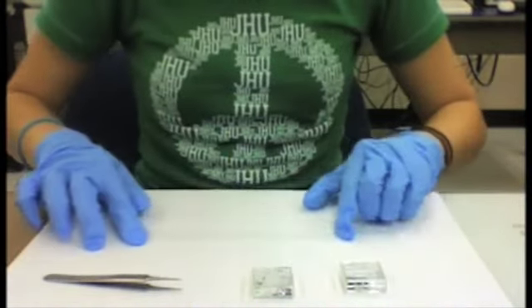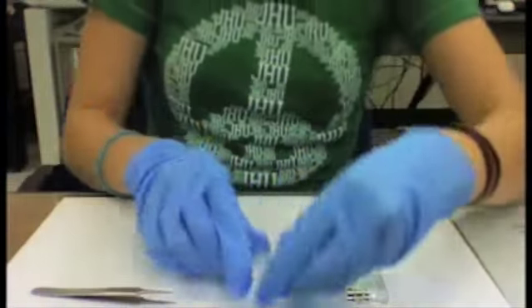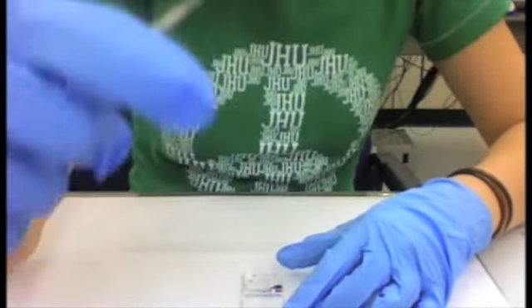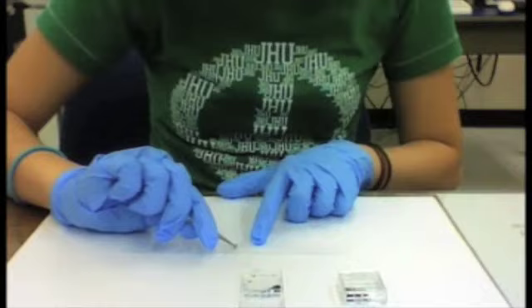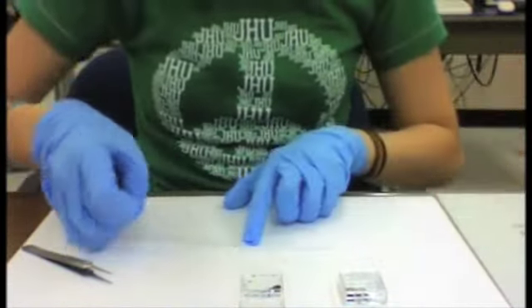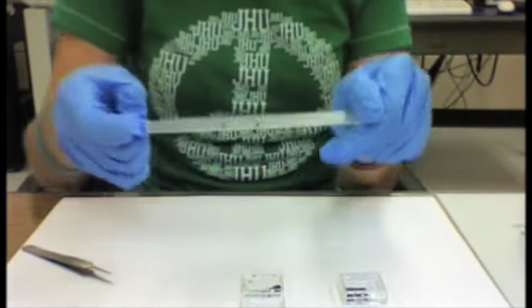First, you take a piece of scotch tape and place a flake of graphite in the center. Then, fold the tape over the flake and slowly peel it back apart so that the flake is cleaved in two.